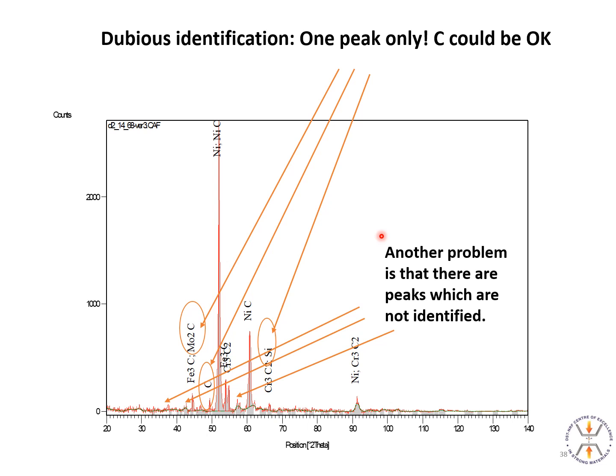The other just showed an example where you had two phases with very similar atomic numbers, and they had very many peaks in that sample because there were a lot of phases in there which were complex.